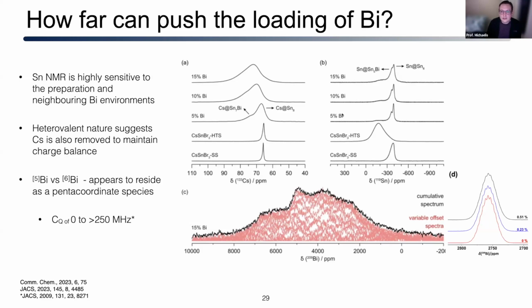I will caution you though, if you start getting into semiconducting materials that are really low band gap, let's say below 0.6, 0.7 eV, or you get into metallics, that's where we typically notice a problem. And so what we'll often do is dilute the samples, usually with dry silica, but there's a variety of samples you can't. That will help you spin the sample and maintain stability.